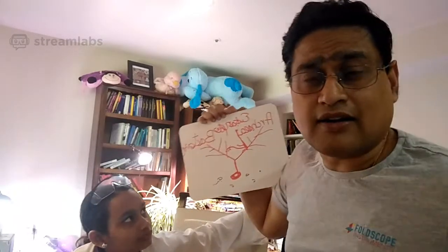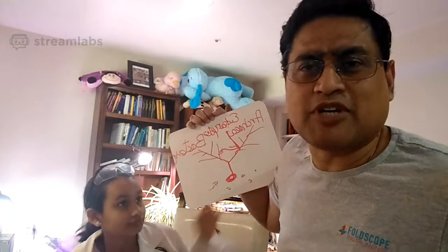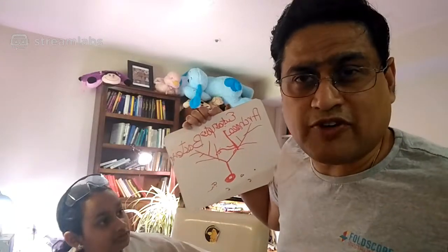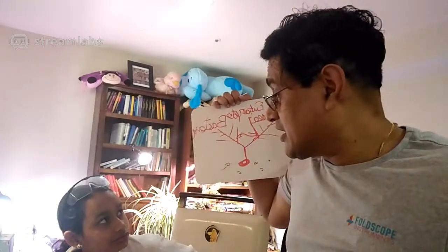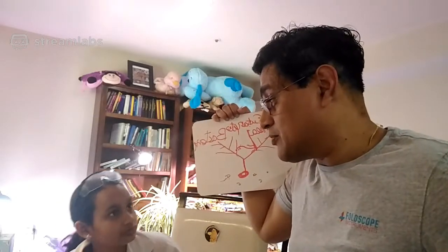Now, archaea, you can get them. They are found in extreme conditions. They're also found in the rumen of a cow. But unfortunately, I don't have any archaea today. But bacteria, I have quite a few.